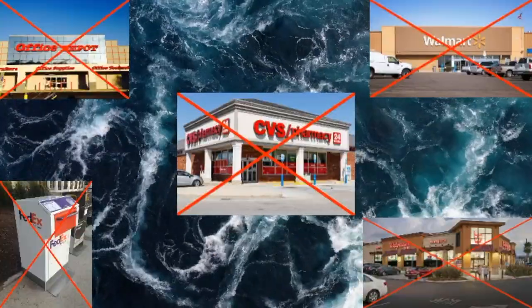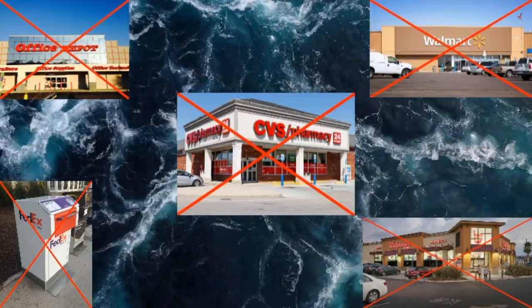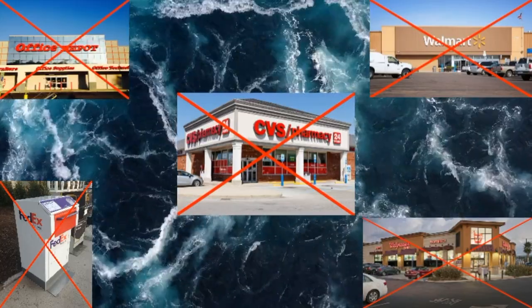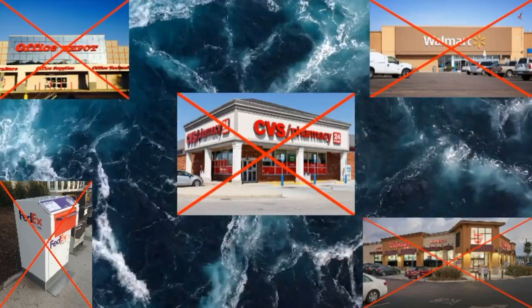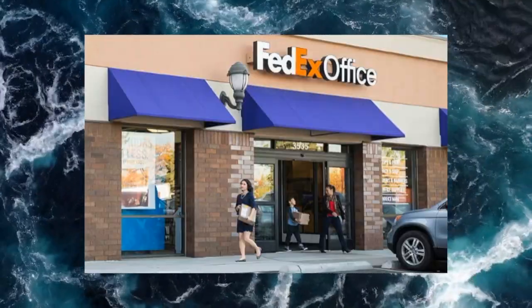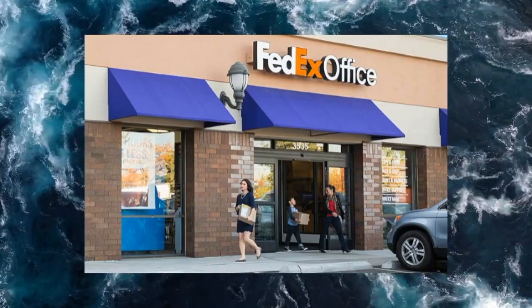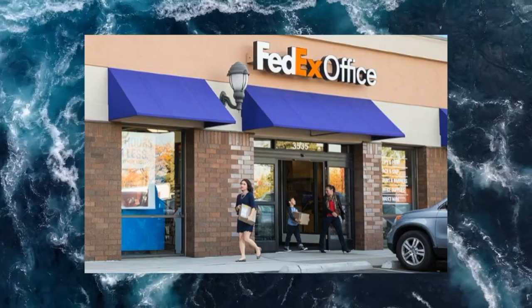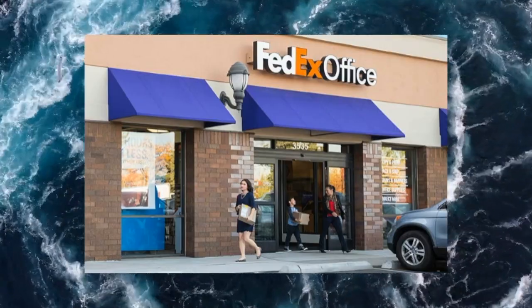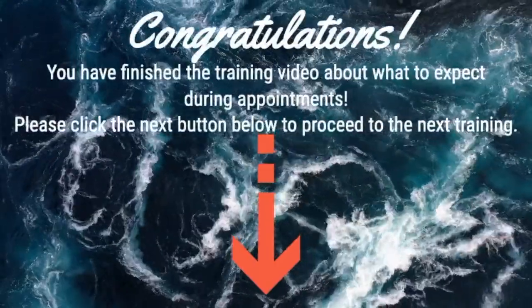Here you can see some locations that would come up on Google as drop-off locations for FedEx. These locations are not authorized for specimens to be dropped off at and would cause the specimens to spoil. Regular FedEx locations that are shipping and printing facilities are the only authorized locations that can take these packages and handle them properly. These locations can be found on Google, but remember not to go to any of the previous locations mentioned in the last slide.